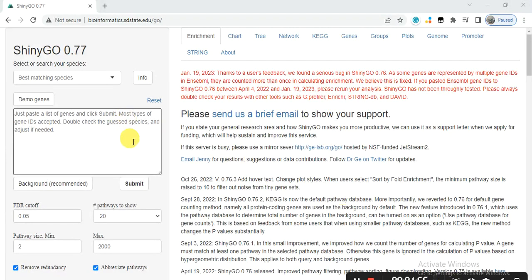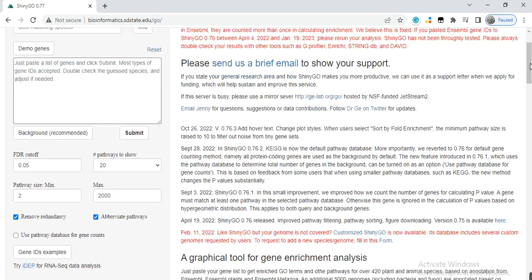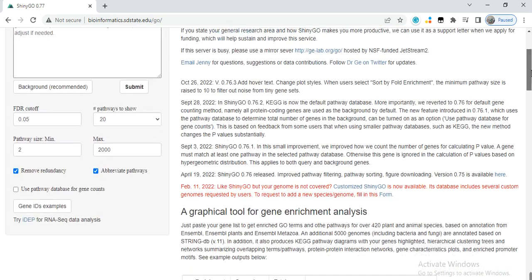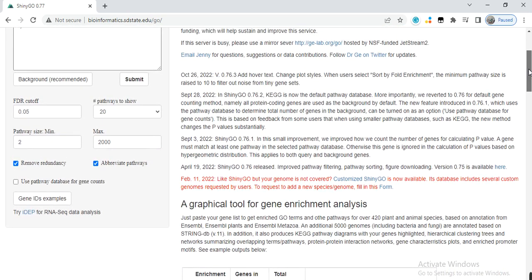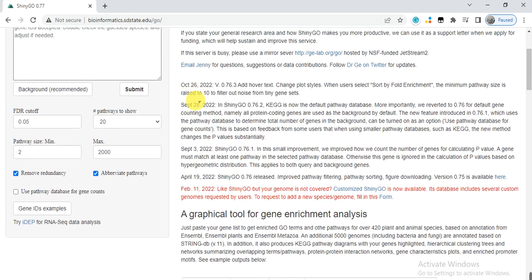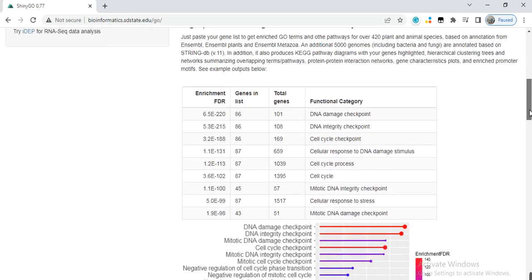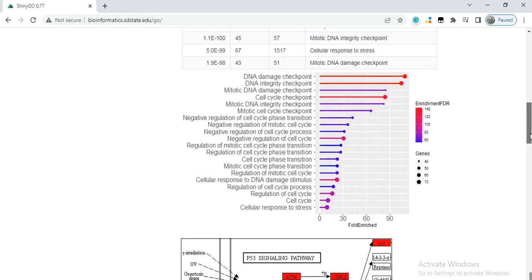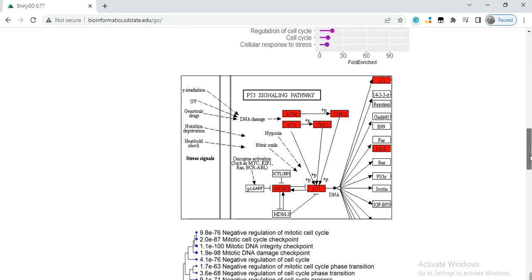It will guide you to this page, which gives some introduction about this website and description of how and what type of graphs you can make through this.